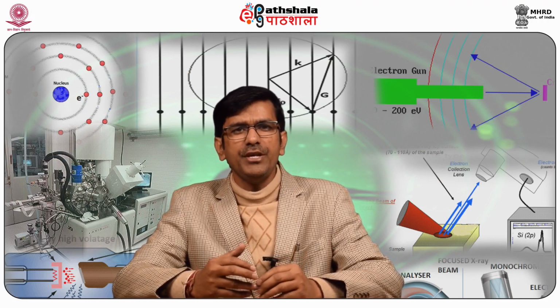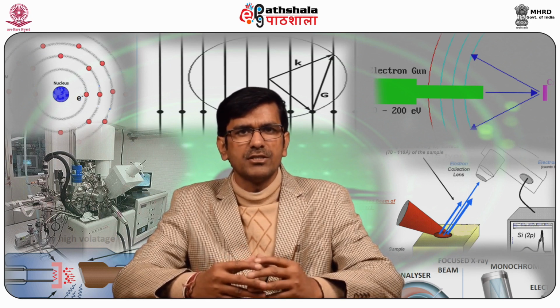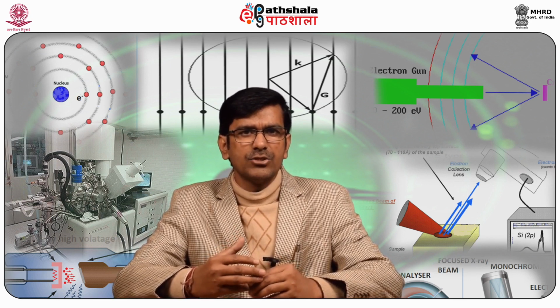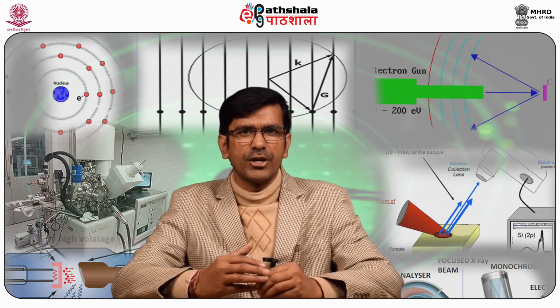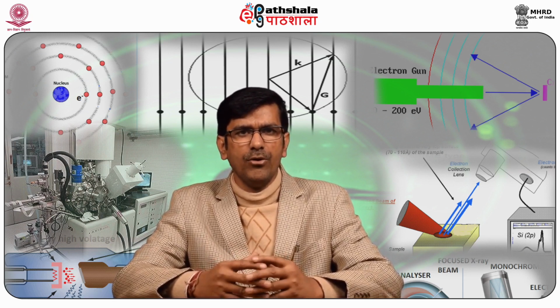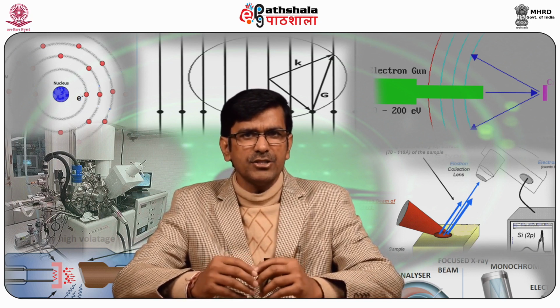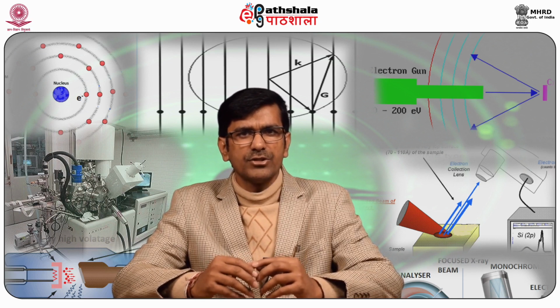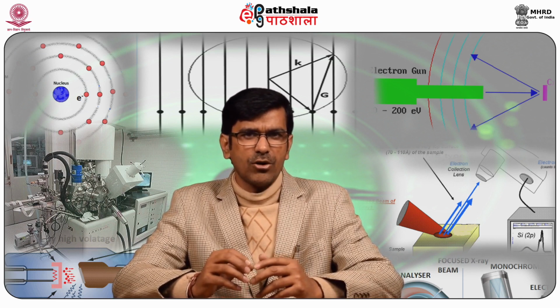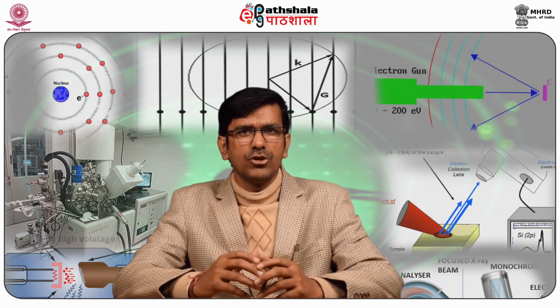Photoelectron spectroscopy or PES spectra are plots of photoelectron count versus binding energy, where binding energy usually has units of electron volts, kilojoules per mole or megajoules per mole. We should keep in mind that higher binding energies correspond with electrons in lower energy subshells, that is, electrons that are closer to the nucleus and therefore require more energy to remove them.